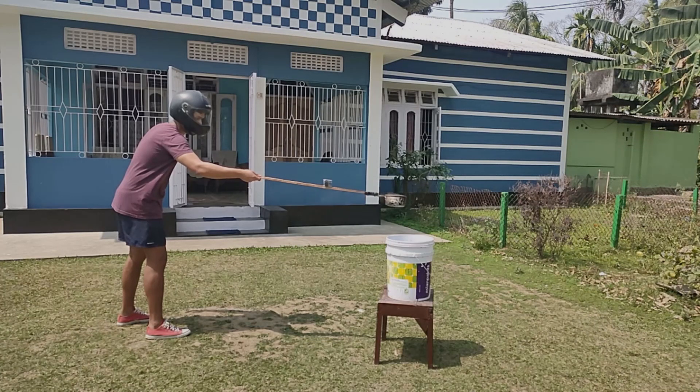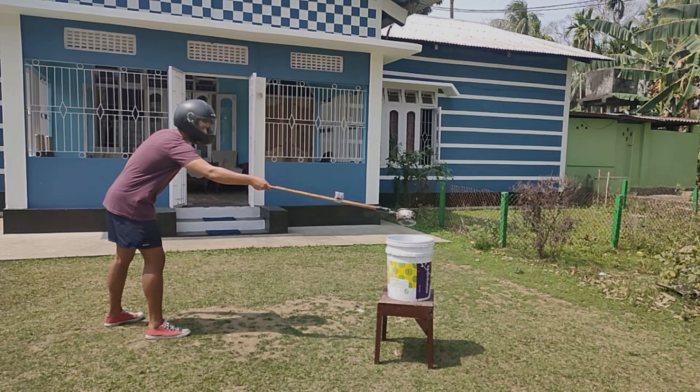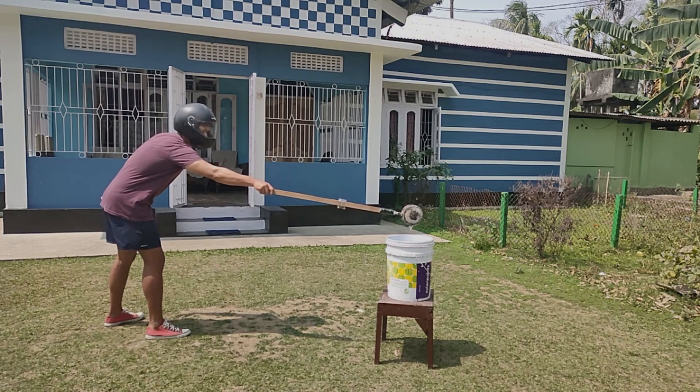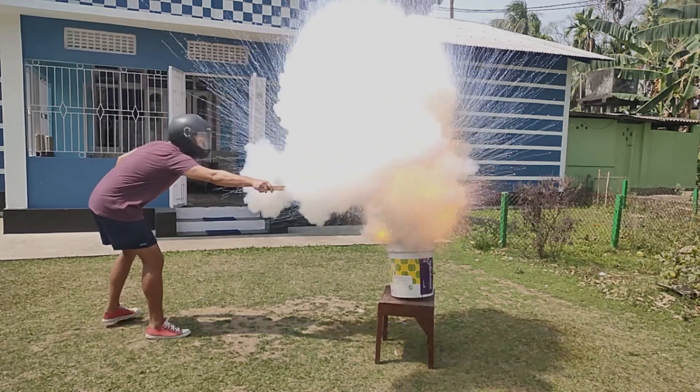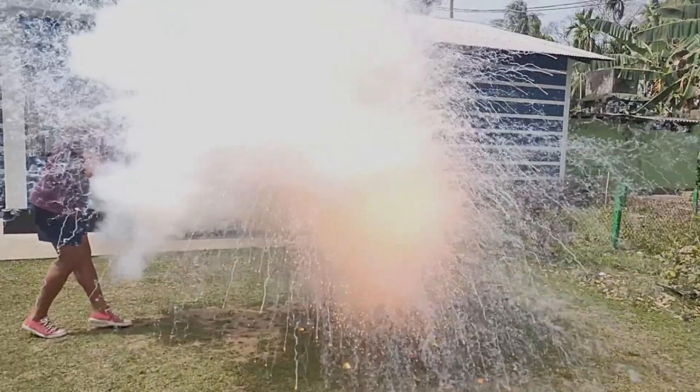The chemical reaction occurring here is that sodium metal reacts with water forming hydrogen gas, which is ignited by the heat energy released during the chemical reaction between sodium metal and water, thus resulting in an explosion.